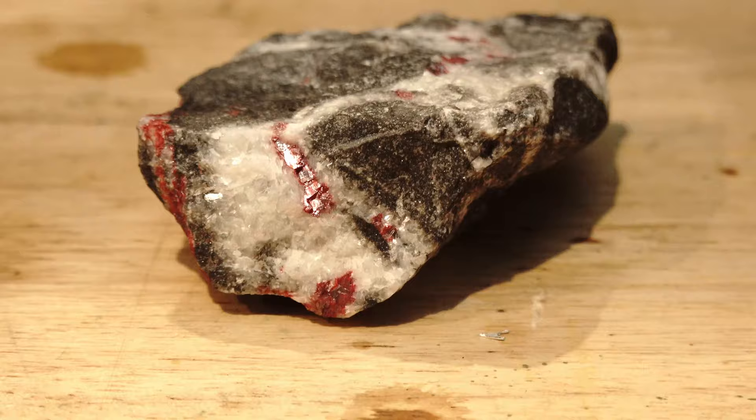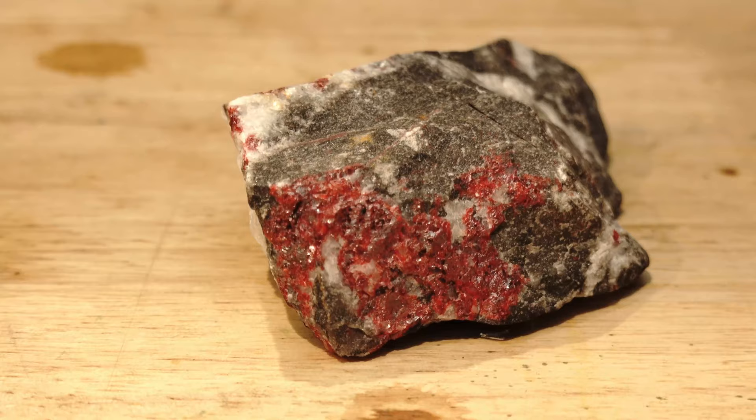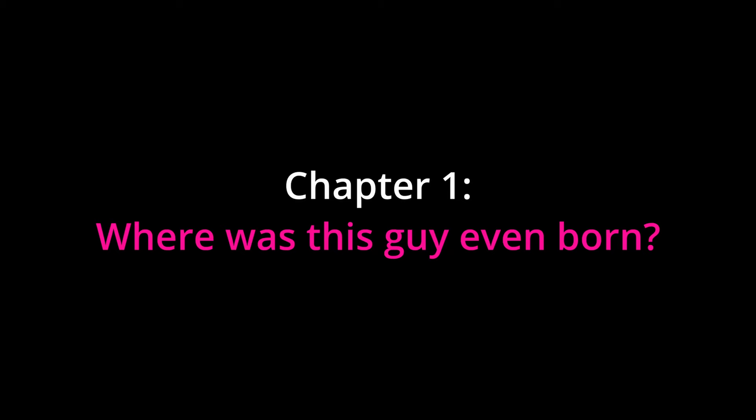This is Cinnabar, a reddish mineral which primarily consists of the infamous mercury metal in its salt form, mercury sulfide. All those red crystals and patches you see are the mercury sulfide, and in this video we'll be cooking it into mercury metal.